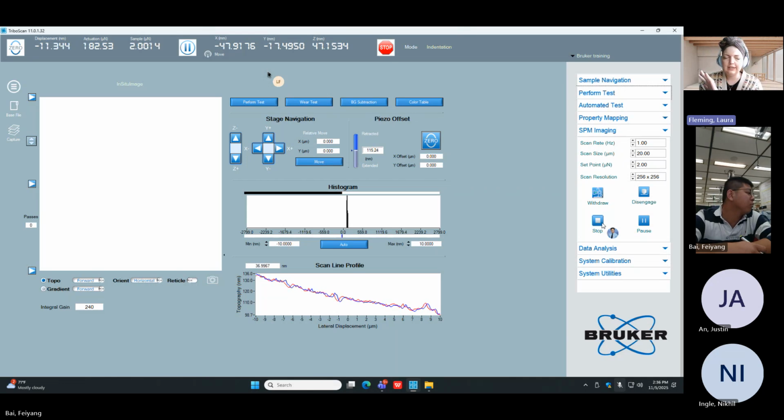So how it works is the transducer is sensing the force, and it's supposed to stay at 2 micronewtons. It's in feedback with the piezo scanner, which is currently moving in X and Y back and forth. And as it moves back and forth in X and Y, it also moves in Z to keep that transducer in contact at 2 micronewtons as close as it can.